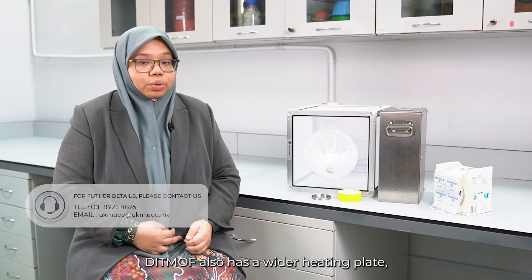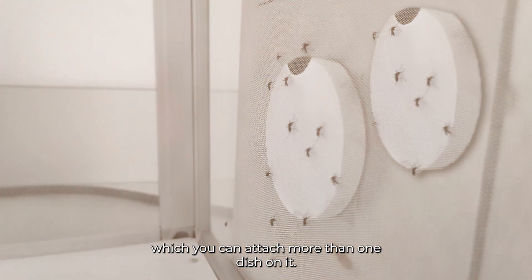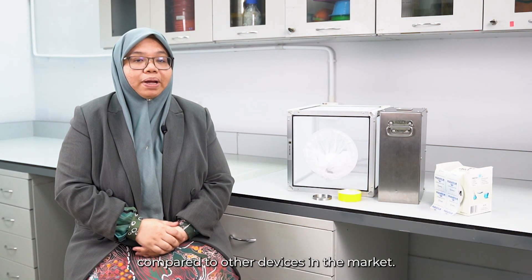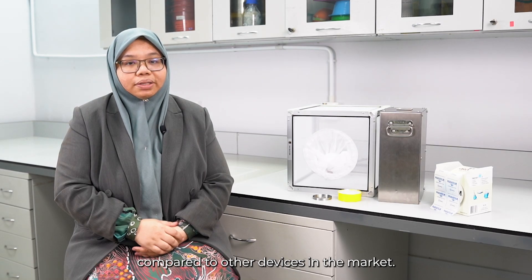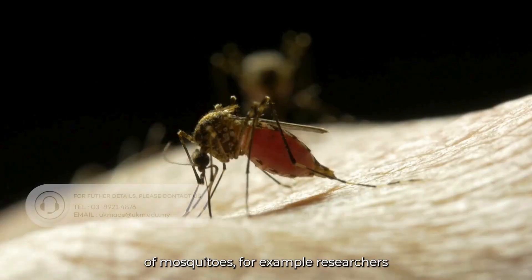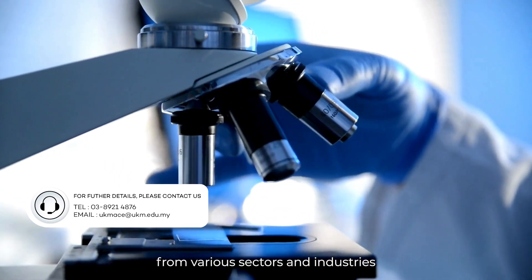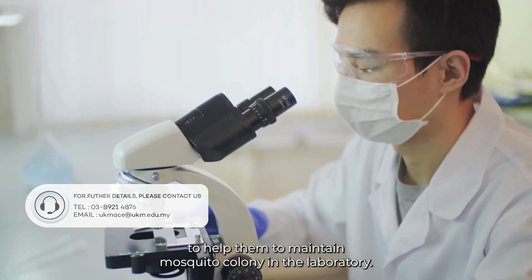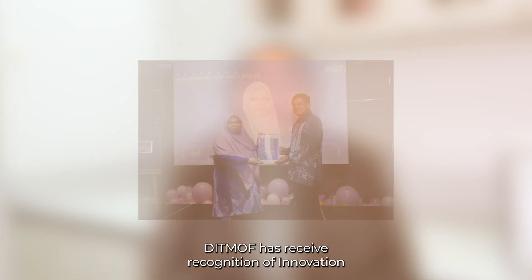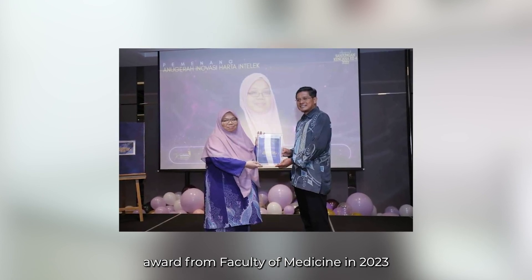DITMOF also has a wider heating plate, which allows you to attach more than one dish on it. More importantly, DITMOF is more affordable compared to other devices in the market. DITMOF can benefit anyone who needs an adequate supply of mosquitoes, for example researchers from various sectors and industries, to help them maintain a mosquito colony in the laboratory. DITMOF has received recognition with an Innovation Award from the Faculty of Medicine in 2023.